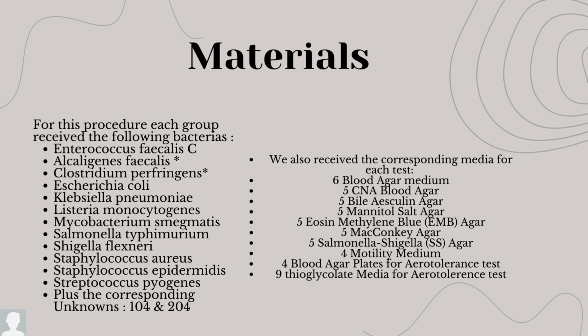The materials for this experiment included the following bacteria: Enterococcus faecalis, Clostridium perfringens, E. coli, Klebsiella pneumoniae, Listeria monocytogenes, Mycobacterium smegmatis, Salmonella typhimurium, Shigella flexneri, Staphylococcus aureus, Staphylococcus epidermidis, Streptococcus pyogenes, as well as our unknowns 104 and 204.